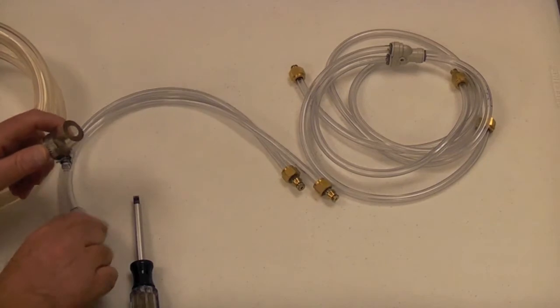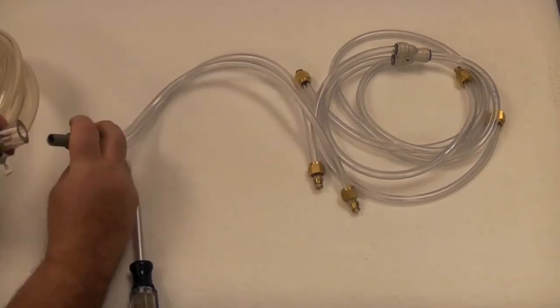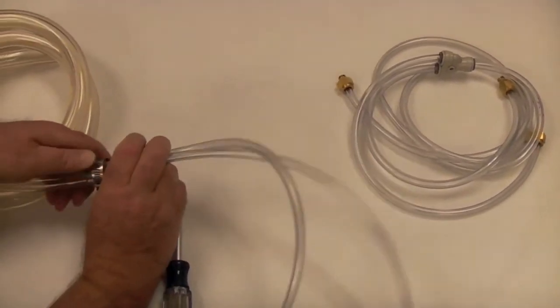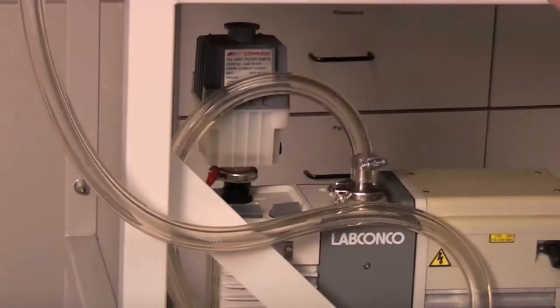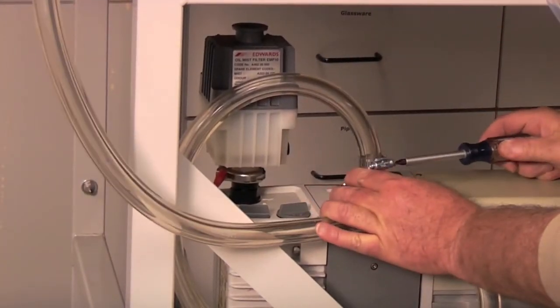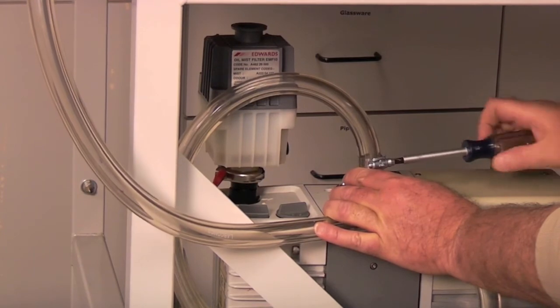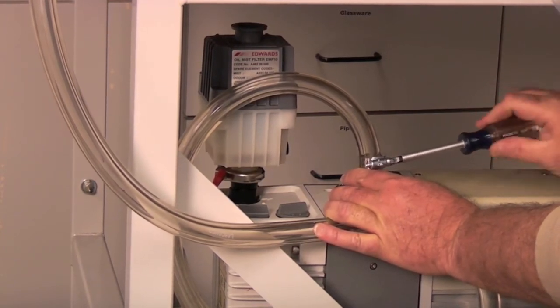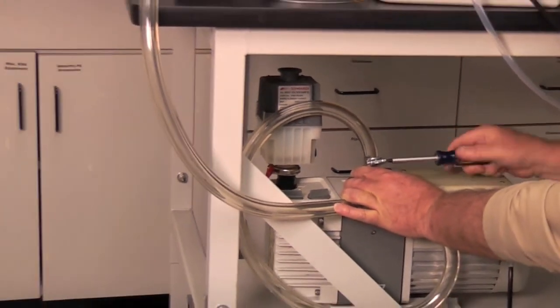To finish the vacuum outlet tube assembly, push the smooth side of the hose barbed adapter into the remaining open port of the two-way divider. Secure the opposite end of the half-inch tubing to the vacuum pump. Vacuum pump tube fittings can vary for various brands of vacuum pumps.